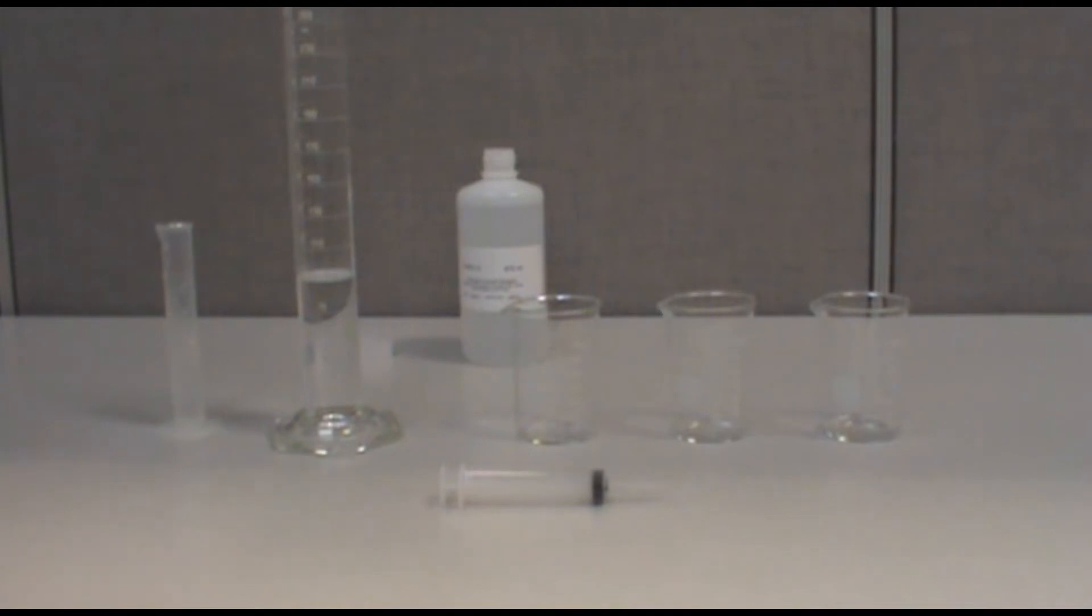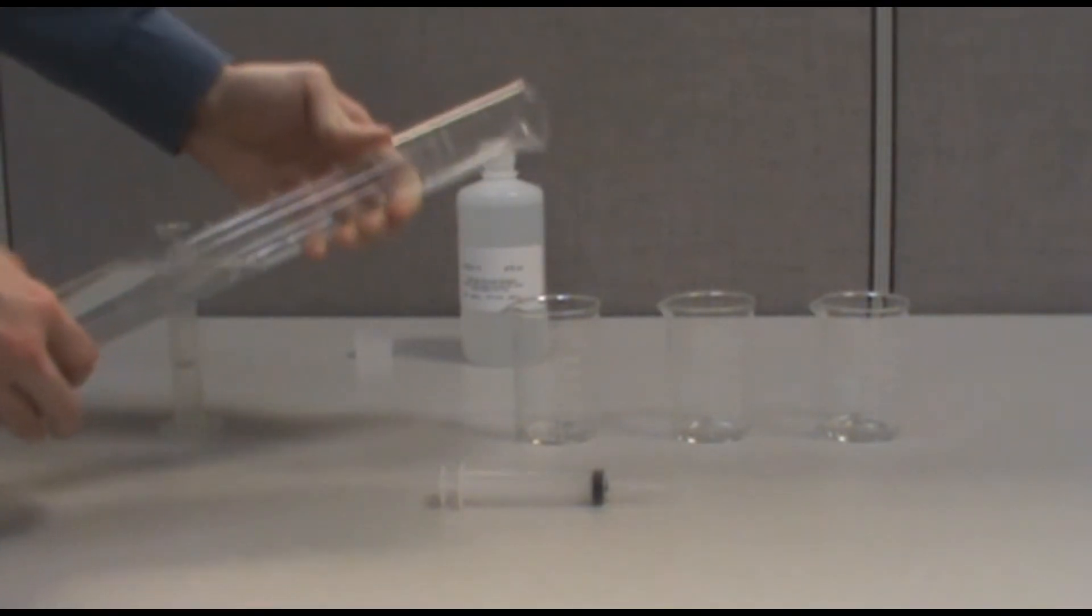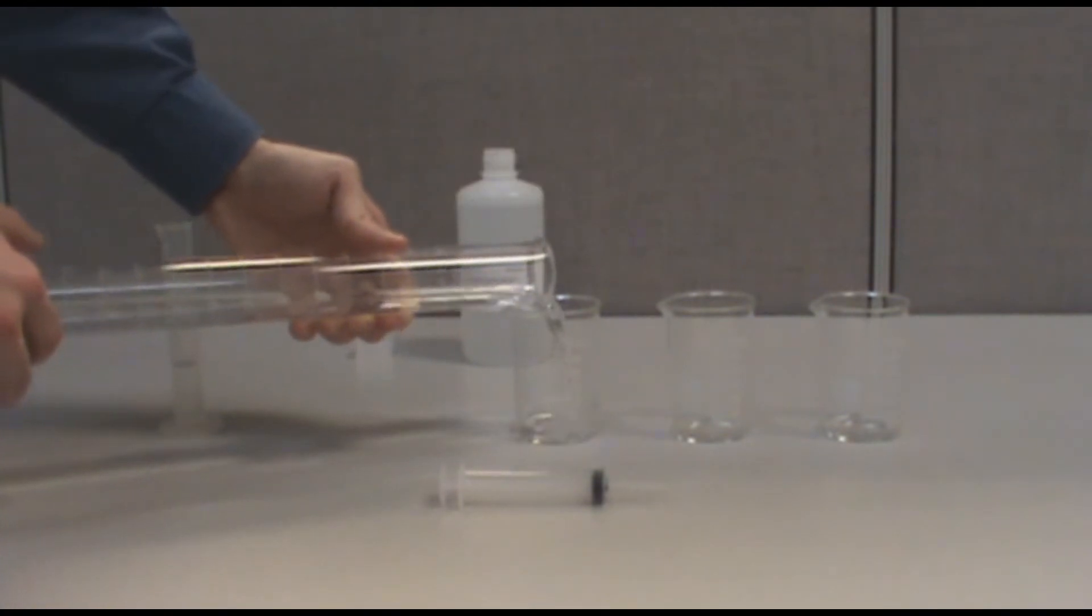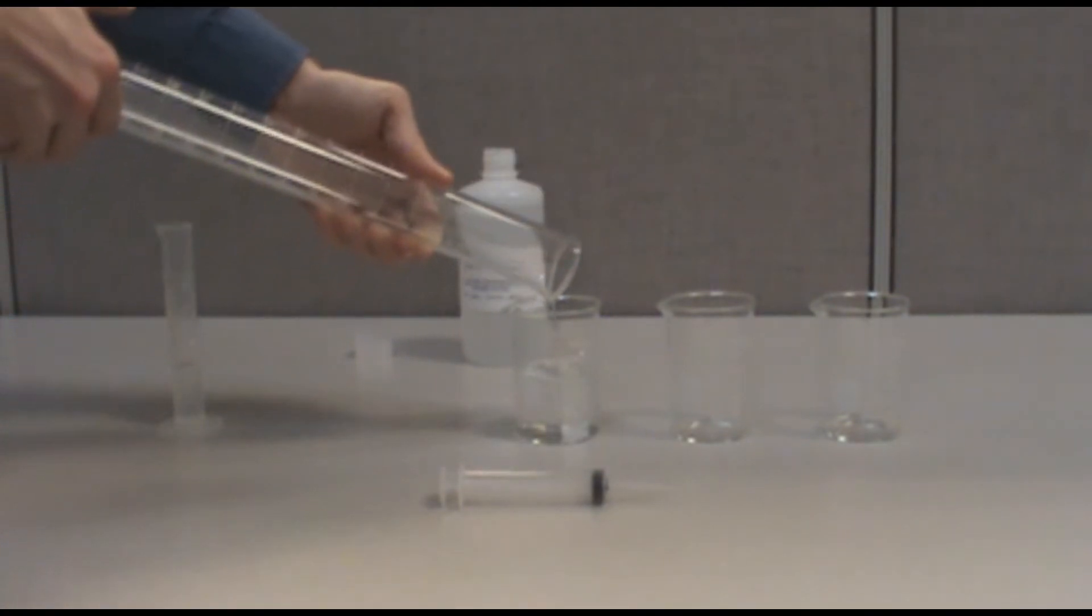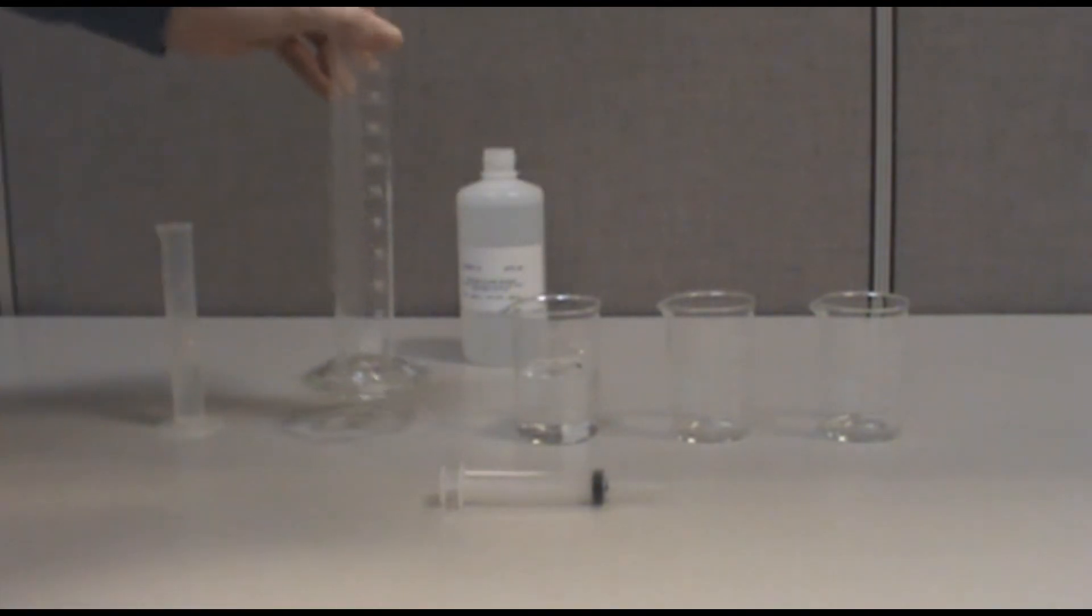To begin, measure 90 milliliters of DI water and 10 milliliters of 1,000 parts per million standard using your graduated cylinders. Pour both solutions into your first beaker and stir them together to create a homogeneous mixture.